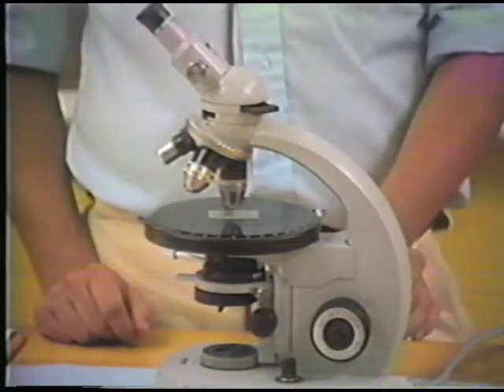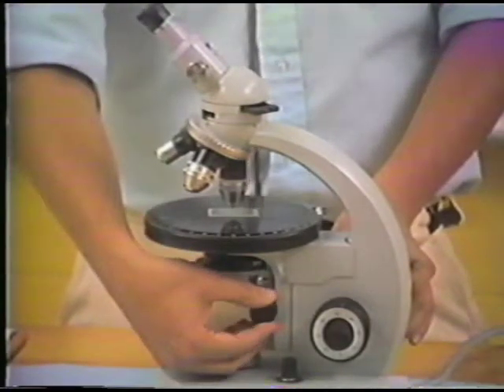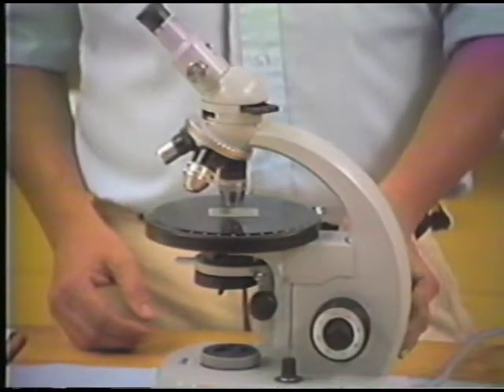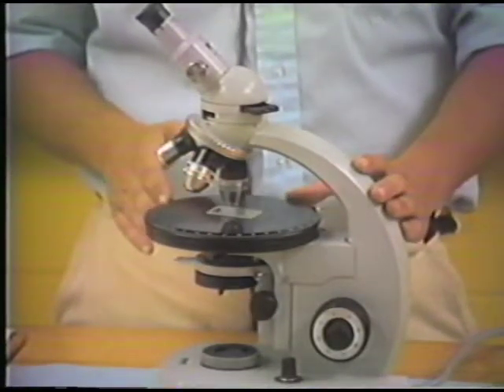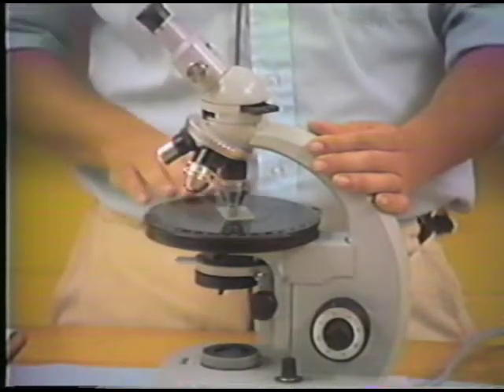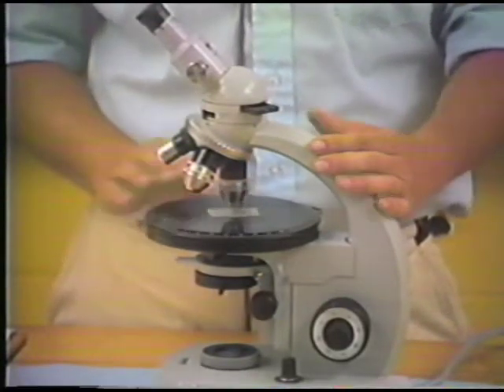So if you get your mineral grain in focus, before you put in the converging and Bertrand lens, you get the maximum amount of light, you get your objective centered. All these things are very important. Then you can put in your Bertrand lens, put in your converging lens, and look for an interference figure. And what you see, if you haven't looked at an interference figure before, is very surprising.